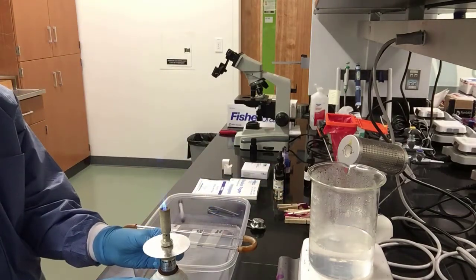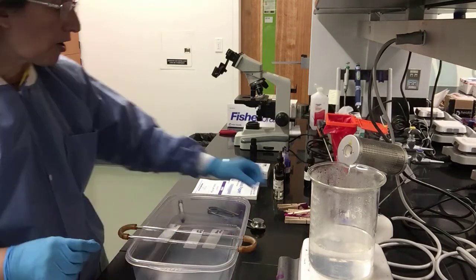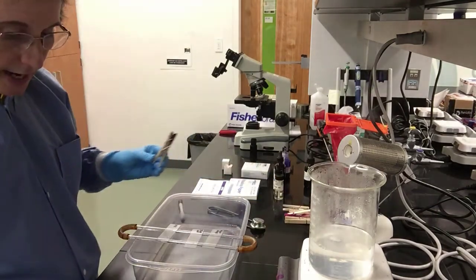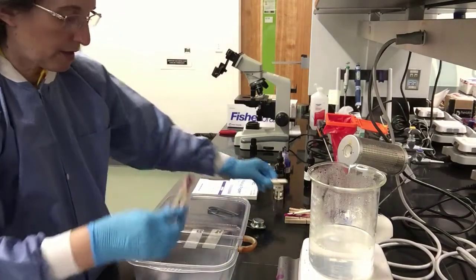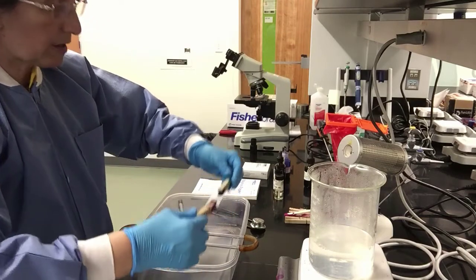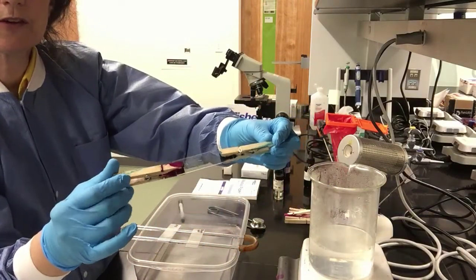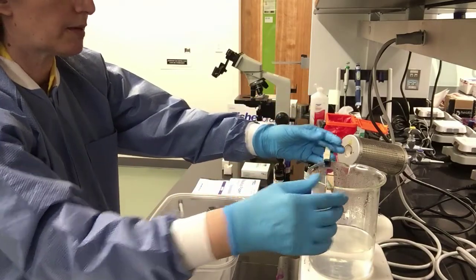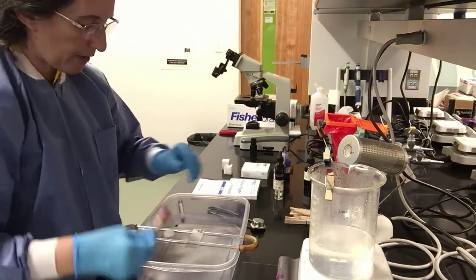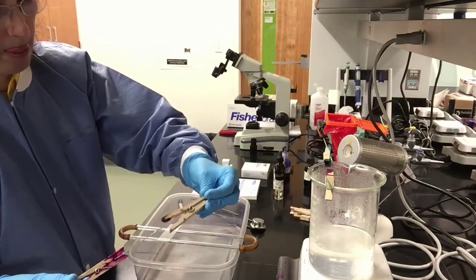And now we will put aside our flame to be safe, and we will use clothespins to clip our slides on both ends so we can set them on the beaker here with the steaming water. You can see this is a nice, easy way to do this. And usually with a big beaker like this one, we can fit all 3 slides onto the beaker.